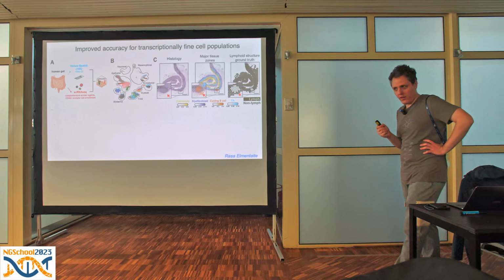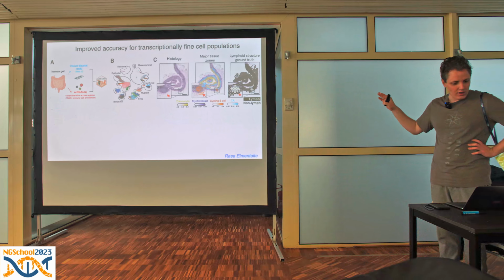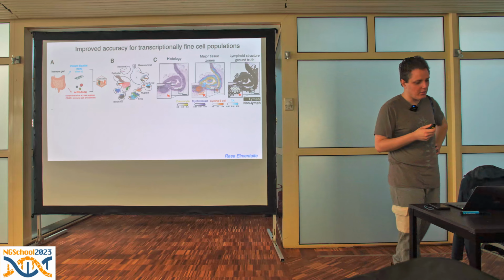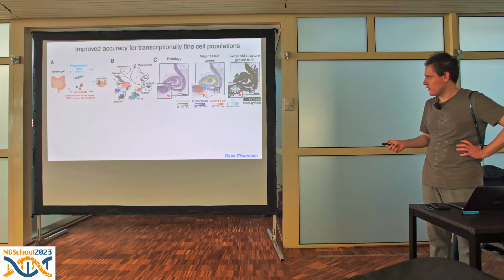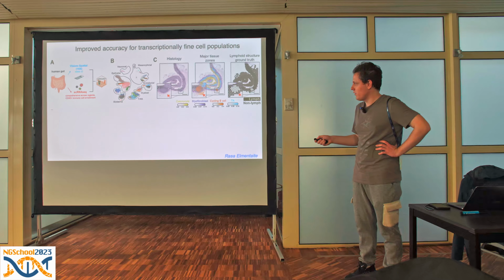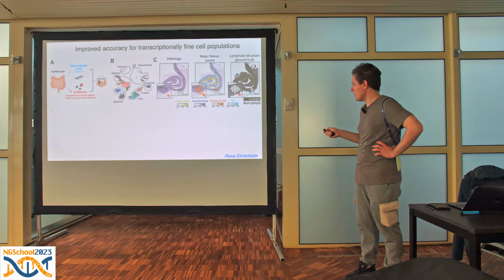So then the second thing that we need to test is, I mentioned in the beginning that we wanted to have a method which allows you to have this high specificity for transcriptionally fine-grained cell types. Can we put this to the test? And we put this to the test by using human colon Visium and a human colon single-cell atlas. This atlas represents all of the tissues within the gut, including epithelial, mesenchymal, and immune cells. And what we expect is that most of the lymphoid immune cells should be present in the lymphoid structure in the spatial data.